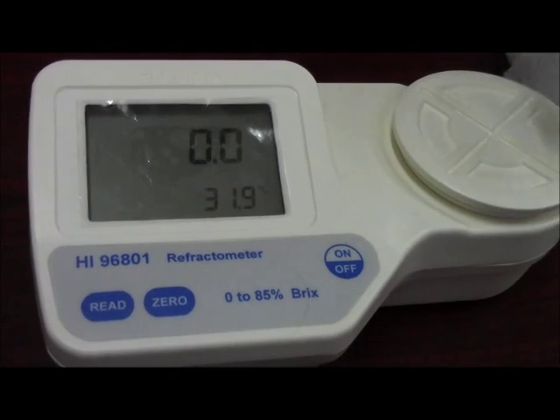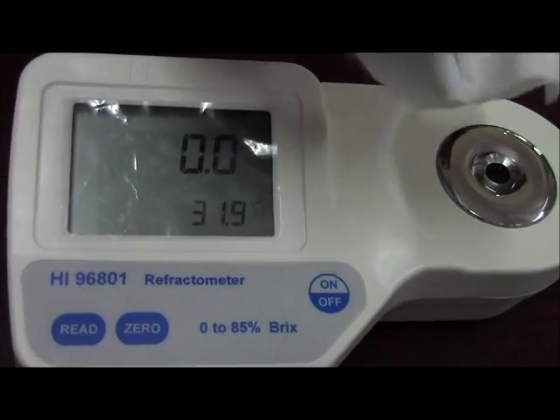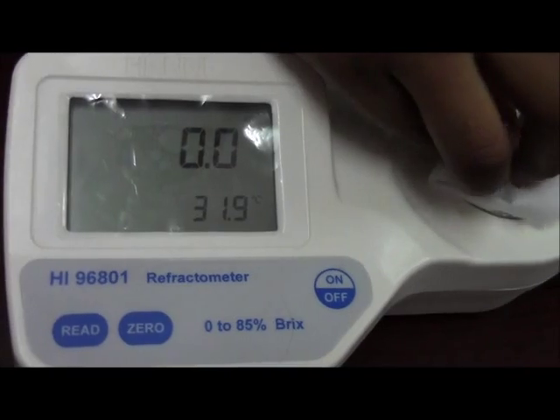Now the meter has been calibrated again. Wipe off the distilled water.